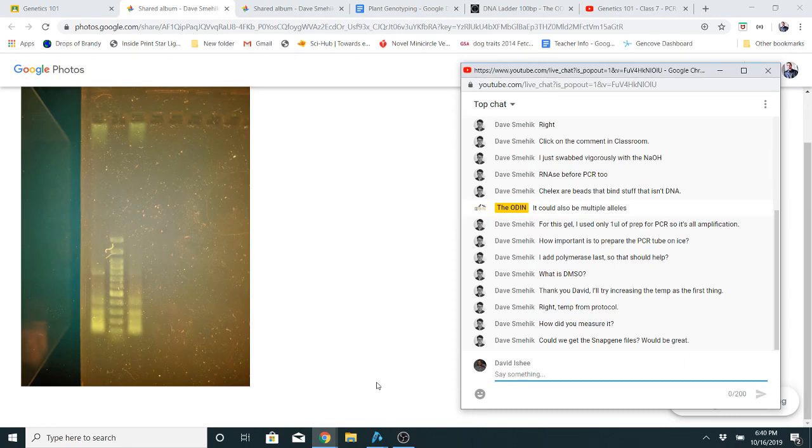And sometimes some thermocyclers have issues with hot spots, especially the older ones. Sometimes the middle will be a slightly different temperature than the edge, so I always try to use the very center wells of mine, and I kind of build everything around those.